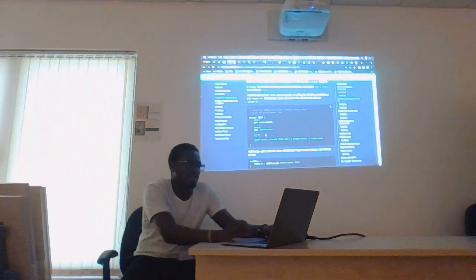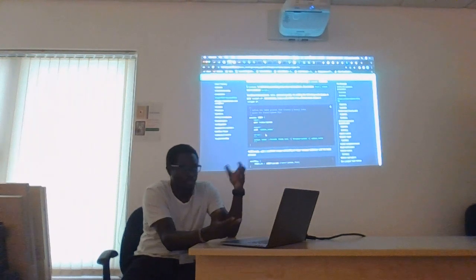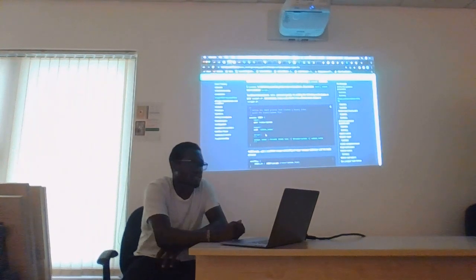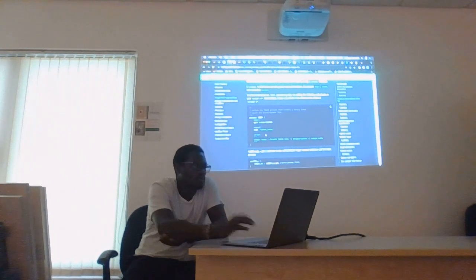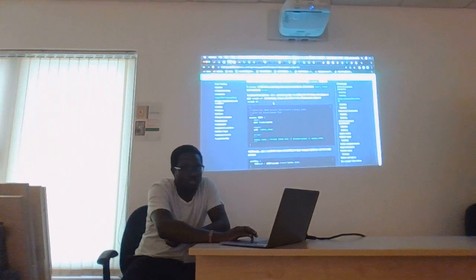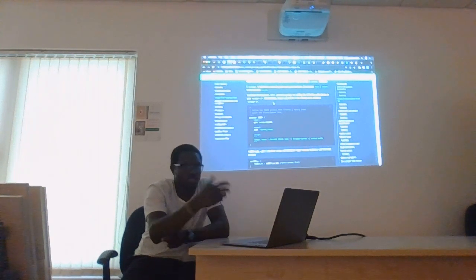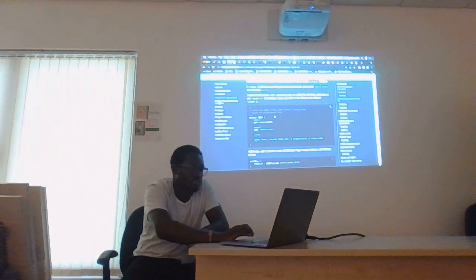Normally when you've done RNA sequencing, you are at times interested in quantifying the transcript abundance in any sample that you have sequenced. Most of the time people use Salmon to achieve that. So the first step you need to do is index that transcriptome, and then later on we will quantify the abundance of our transcripts.